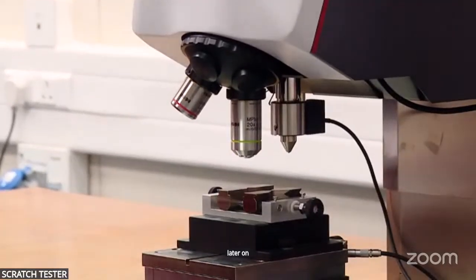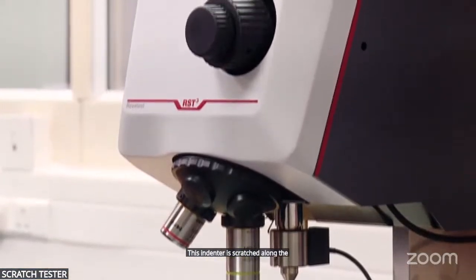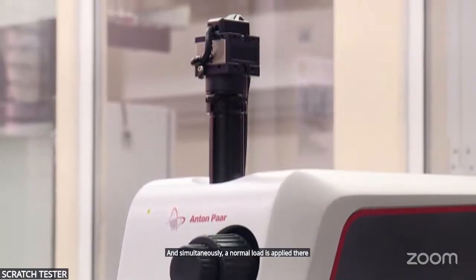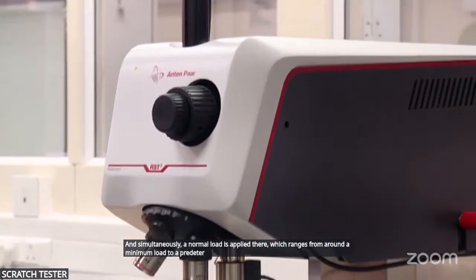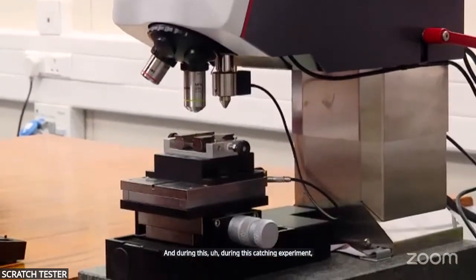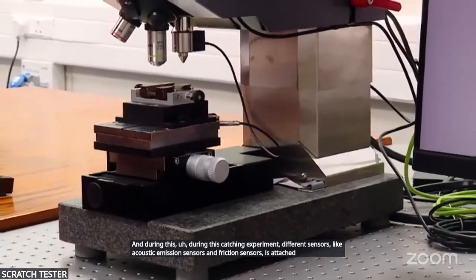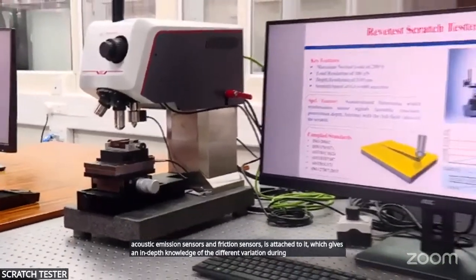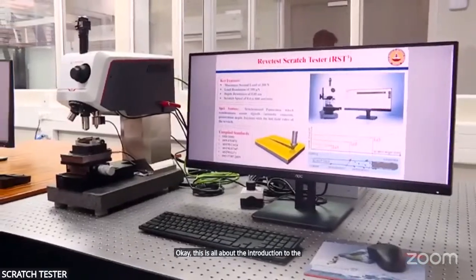Now, in this particular RST machine, we have an indenter, which is the Rockwell C-type spherical indenter, as you can see here. We will look at this in more detail later on. During the scratch test, this indenter is scratched along the coating surface, and simultaneously a normal load is applied, which ranges from a minimum load to a predetermined maximum load.